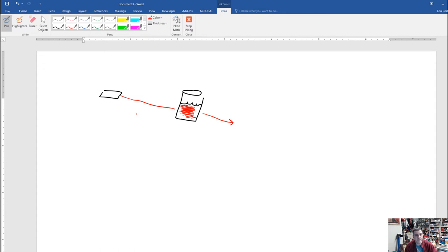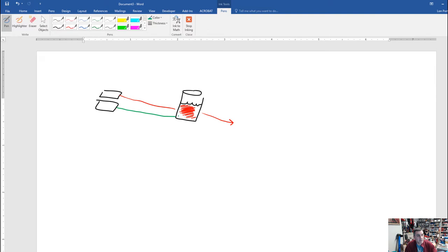Then we took a green laser pointer and hit the red solution with green light. Do you think it would be absorbed or transmitted? In this case, the green laser got weaker and weaker as it went through the solution, because the red dye molecules were absorbing the green light in a way they did not interact with the red. That was really thought-provoking — why would a red solution let red light through but absorb green?